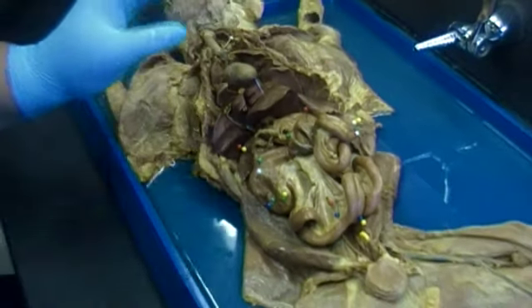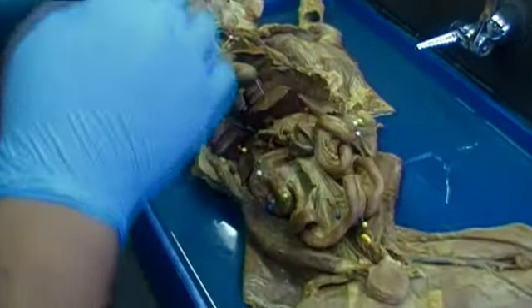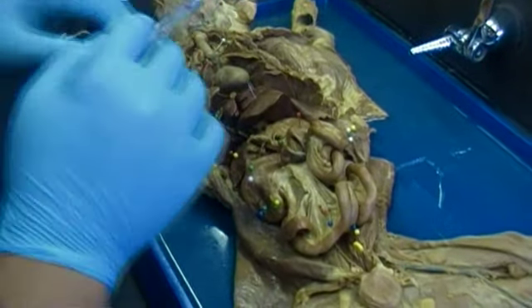If you give me a few minutes, I will remove some of the pins and re-pin the cat for the respiratory system.